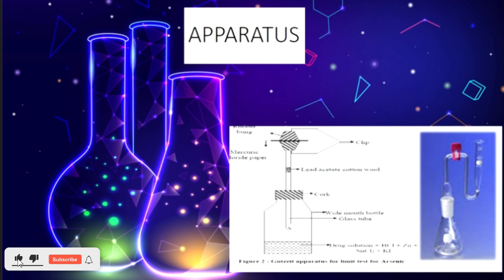I think you clearly understand the limit test for chloride, sulphate, arsenic, heavy metals, and also I think you have learned in detail about what a limit test is.